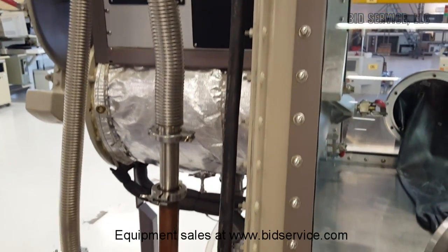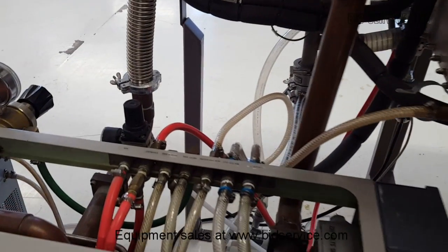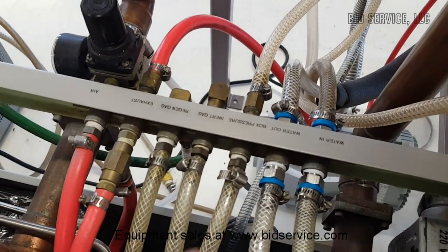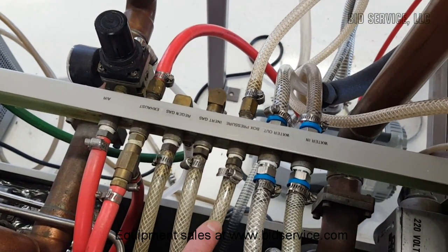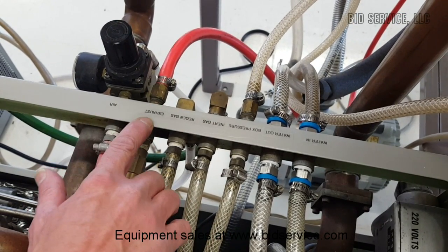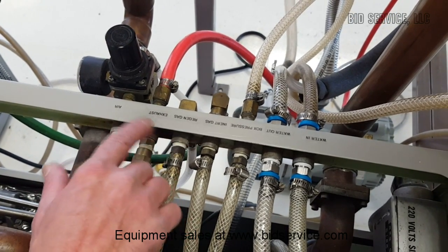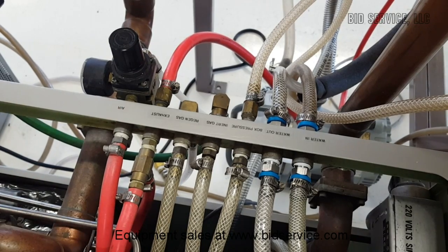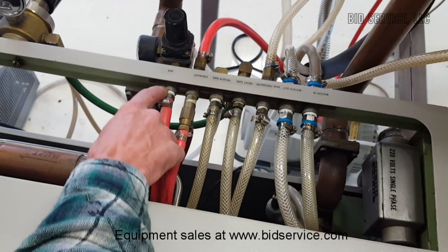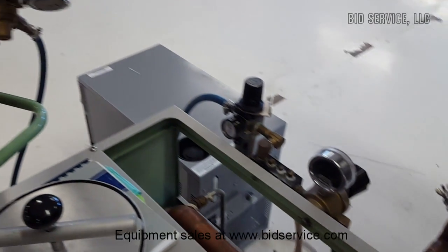I've labeled all our other utilities that are required — it's upside down from this view. We have water in and water out, a box pressure line that reads the pressure inside the glove box, an inert gas inlet, a regen gas inlet, an exhaust for during regeneration, and an air supply that operates the air-operated valves on each of the purifiers. We're bringing in inert gas through a regulator here — I have a cylinder of nitrogen in here.